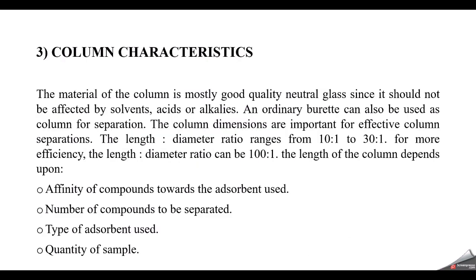Next is column characteristics. The material of the column is mostly good quality neutral glass, since it should not be affected by solvents, acid or alkalis. An ordinary burette can also be used for column separation.